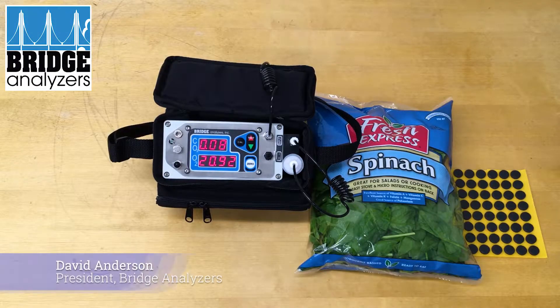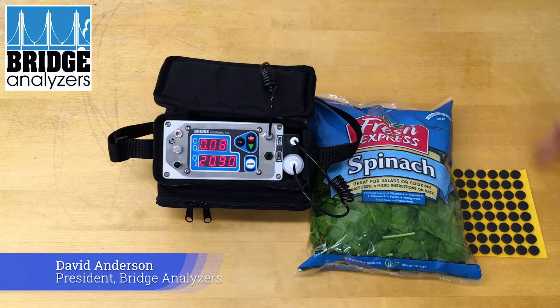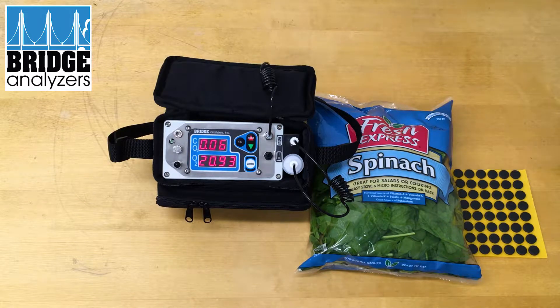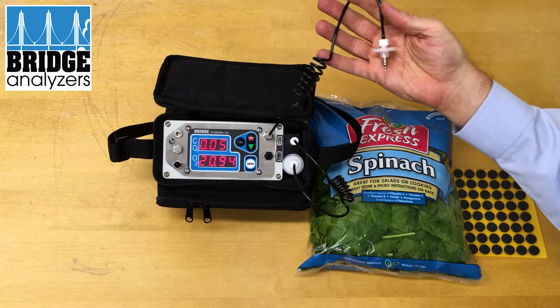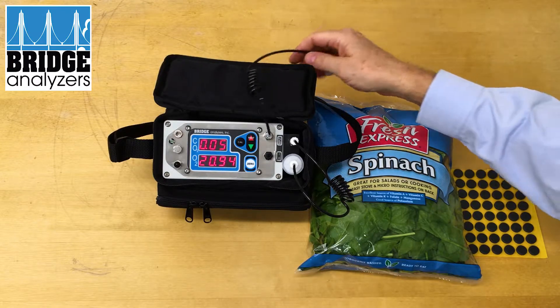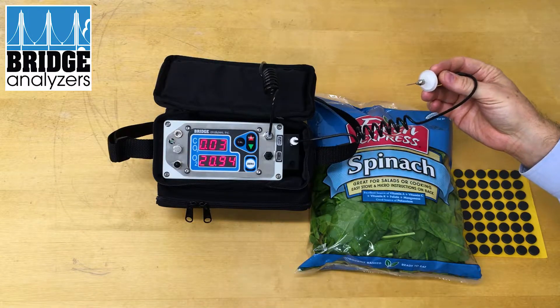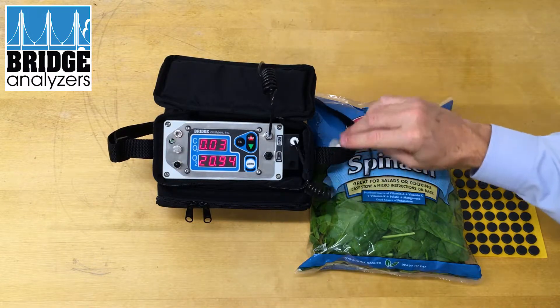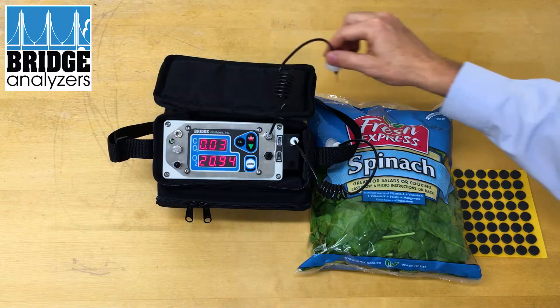We had a request from a customer to recycle the gas that was being tested from a package back through the package itself. This can be done with a customized unit that is customized at the factory to include a sample needle on the exhaust, so we're going to input the gas from the package using this needle and then with this needle also plugged in, we will be recycling it back into the package.